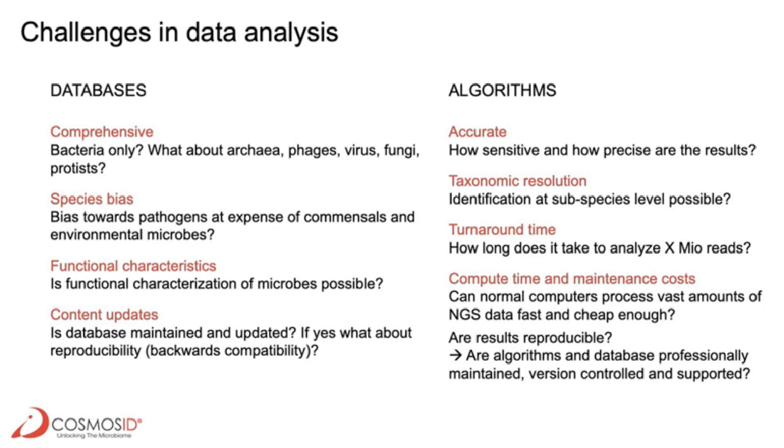It must have broad and deep representations of non-bacterial microbiota like archaea, fungi, protists, and viruses. It is also critical to make sure that the database has adequate representation of commensals and environmental microbes in addition to pathogens. We need to ensure that databases are well maintained, version controlled, and periodically updated.